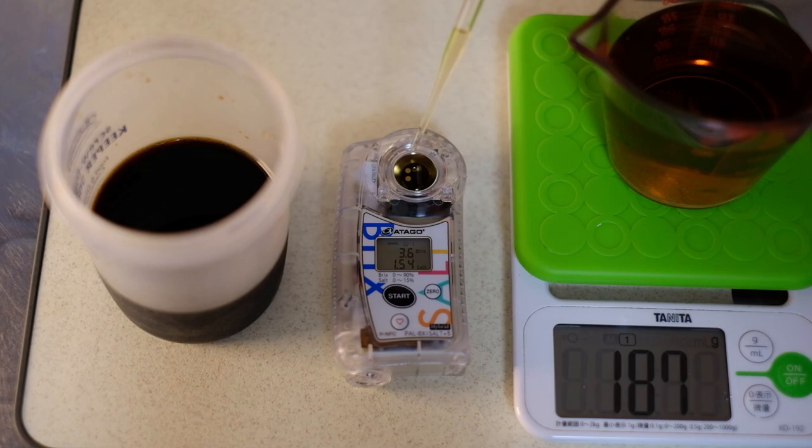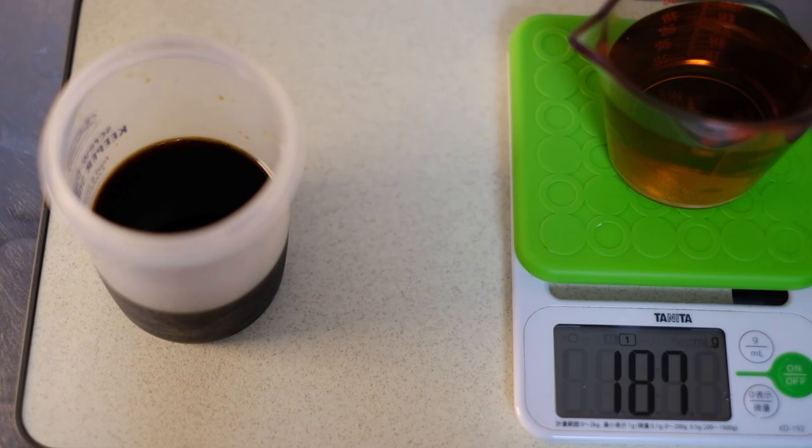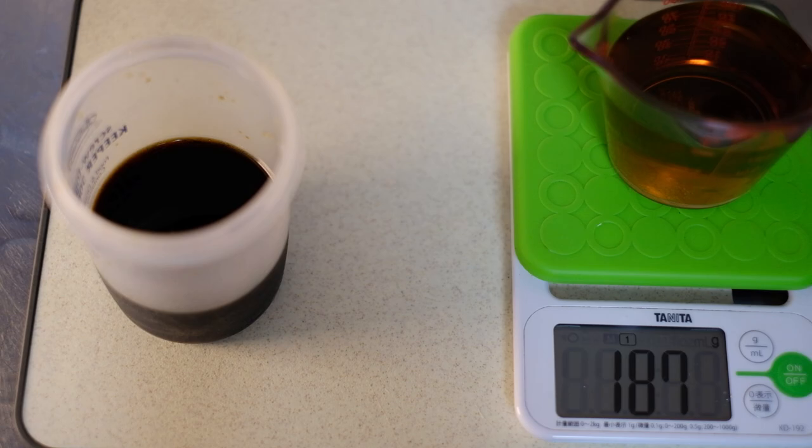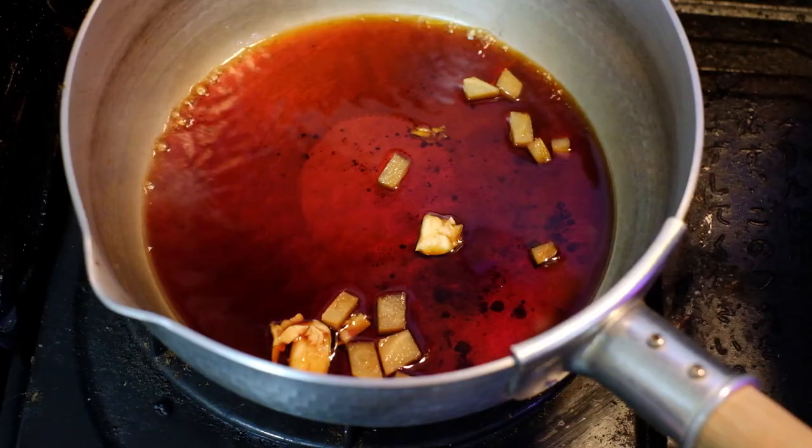Check it out if you're interested in getting one. And I want to thank Atago for sending these units over to me — they were really fun to play with and test out soup from different shops and my own creations. As the name suggests, it is a pocket-sized unit, so I might carry it with me on some trips and just test some ramen soup on the sly. See what other shops are coming up with.